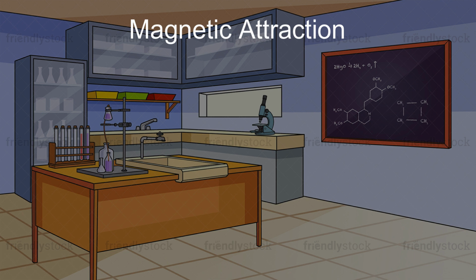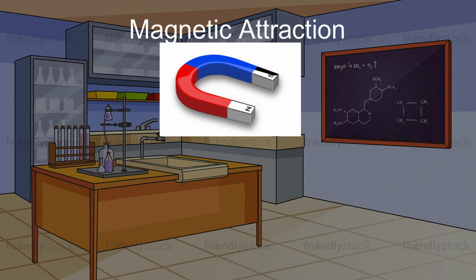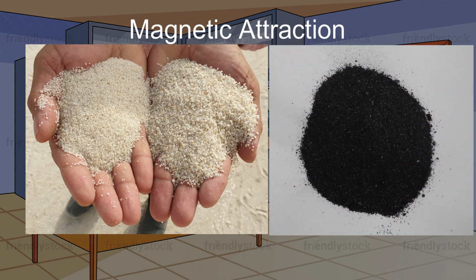After I've separated the solid substances from the liquid, I'll leave the solid, which is composed of sand and iron filings, to dry out in the heat. And then, after that, I'll be using a magnet in order to separate the iron filings from the sand. And after that process, we now have separated the sand from the iron filings.